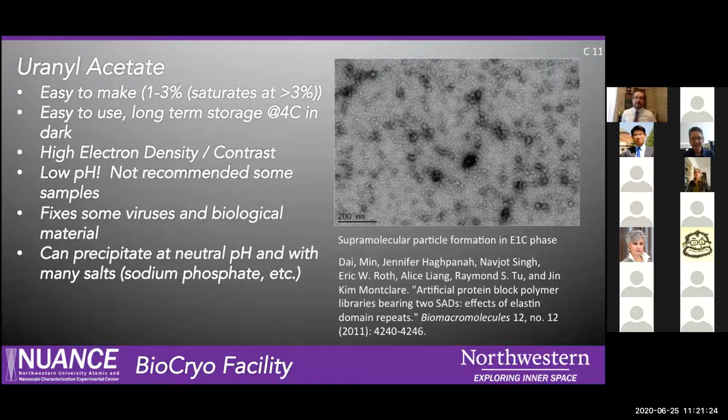So uranyl acetate, which a lot of people are using, again, because I think we've said this is what somebody else has been using in our lab. This is what they taught me, and so I just stay with it. It's also very easy to make up, and it can be made in advance, and therefore it's readily on hand.